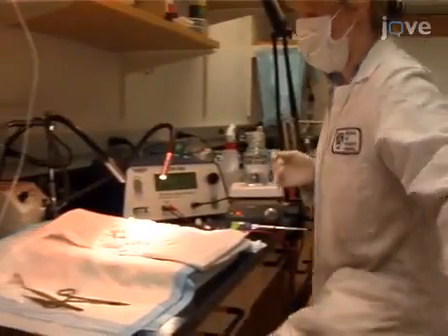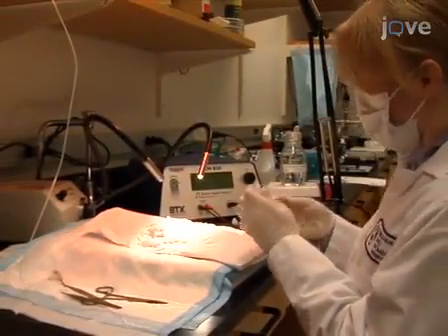Prepare an injection needle as described in the accompanying text. Avoiding bubbles, backfill the needle.